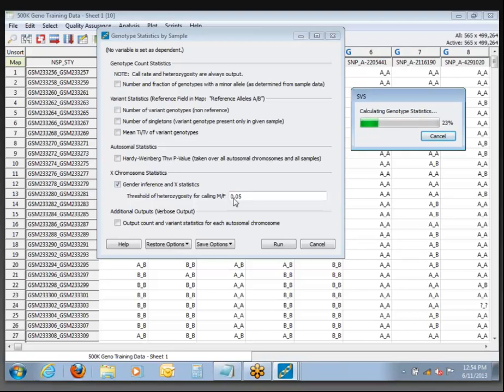We increased the threshold up a little bit to 5% because this particular data set has some noise in males where some of them have a 2% or 3% heterozygosity rate on the X chromosome. Any questions while we're waiting for this to run? Is everybody keeping up?